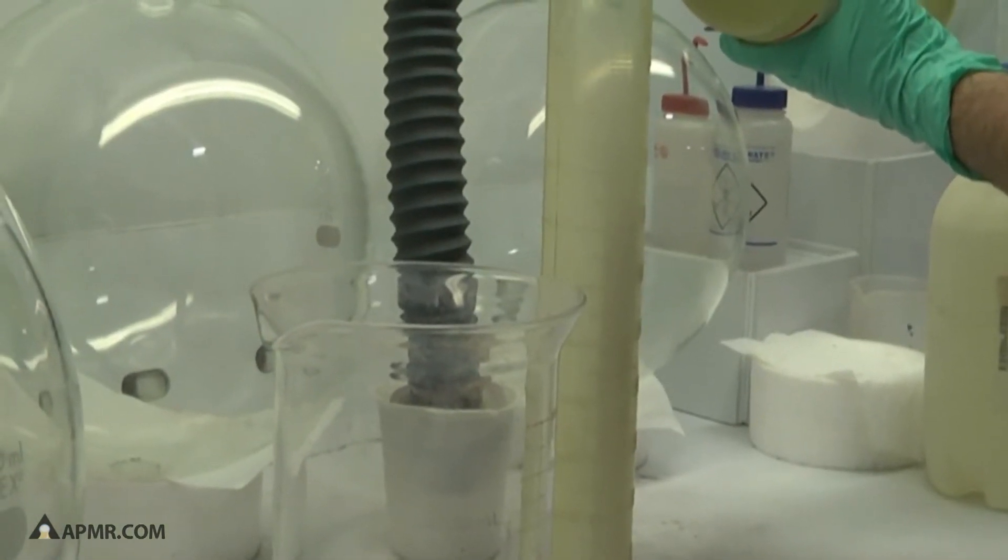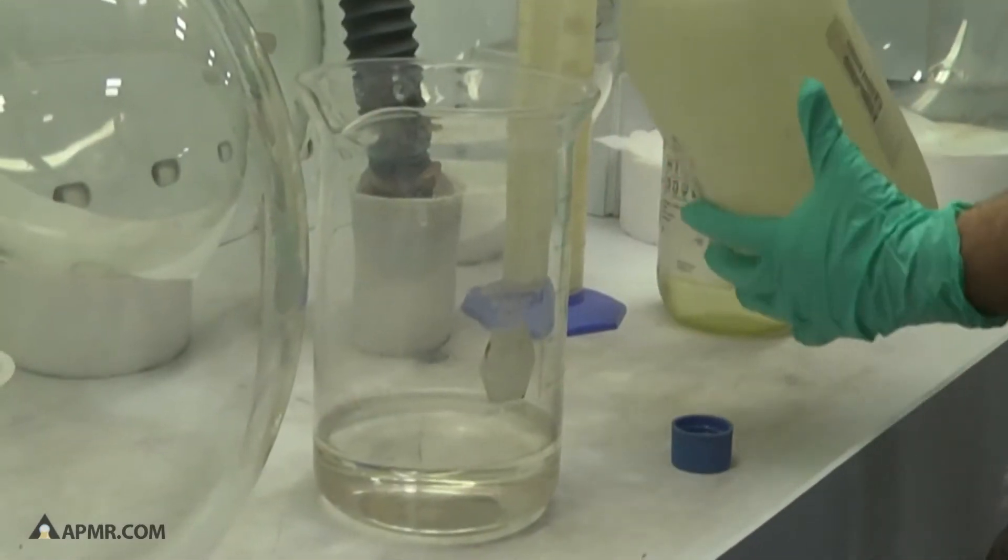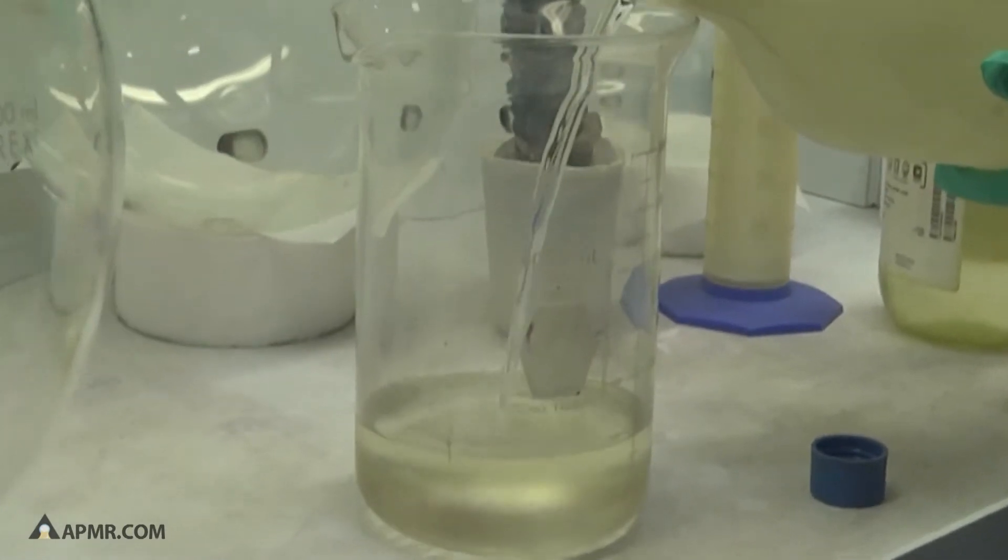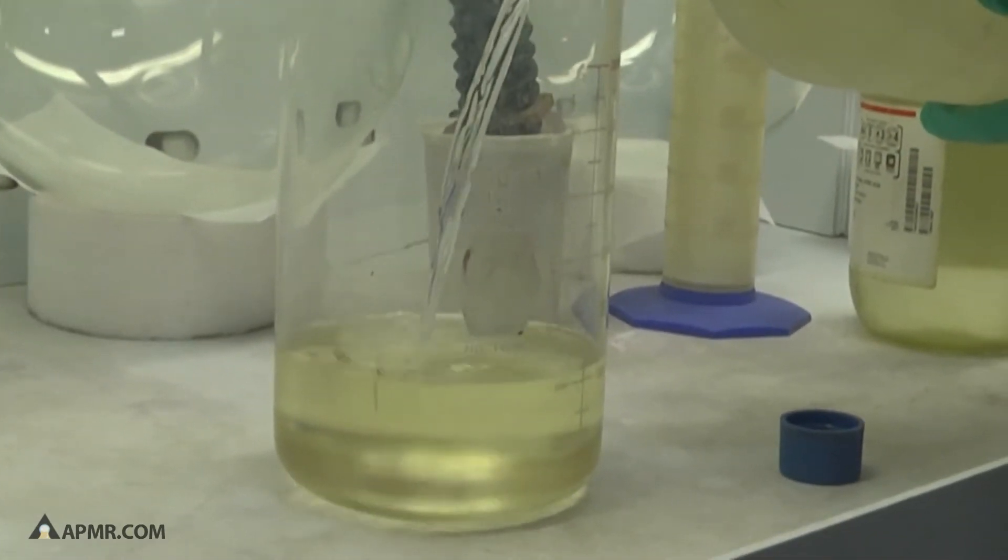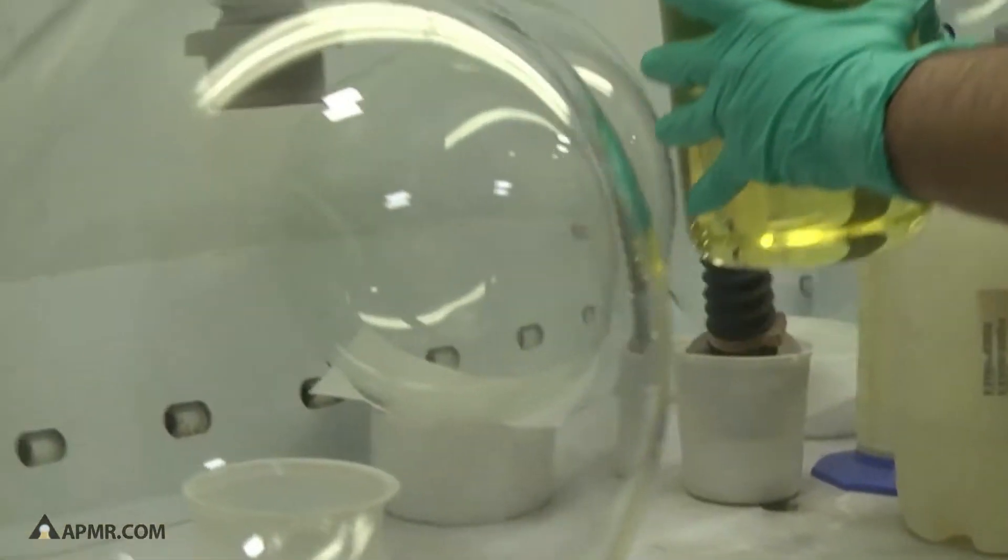We have some nitric that's being measured first. Next we're going to measure hydrochloric up to the required ratio. And now the acid is going to be added to the metal in the flask.